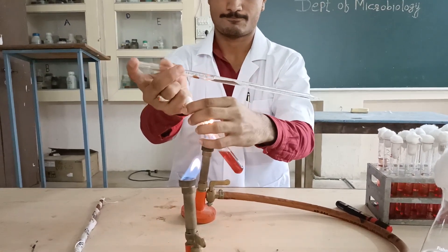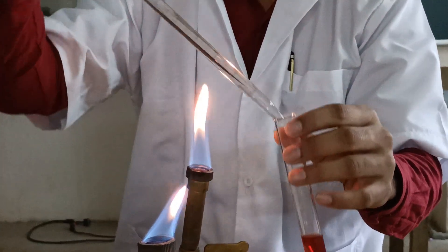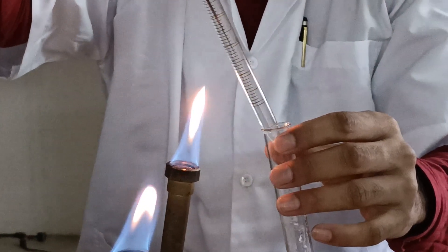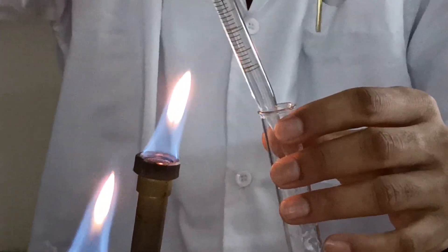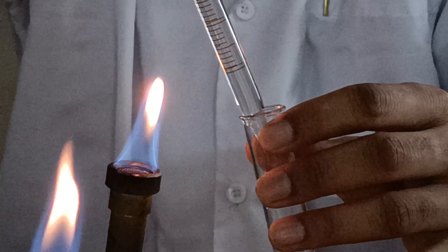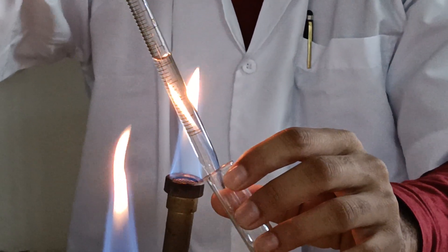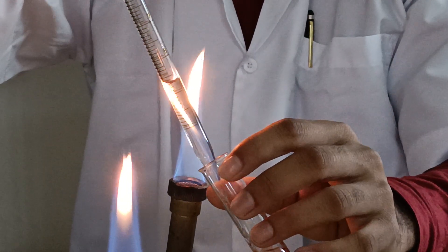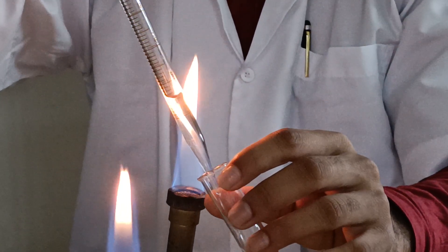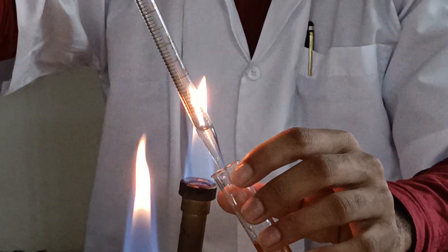The second test tube of double strength McConkey's broth is to be inoculated with 10 ml of the given water sample, performed aseptically so as to avoid external contamination. Care is taken to avoid contamination; we should not touch our hands to the tips of the pipette.